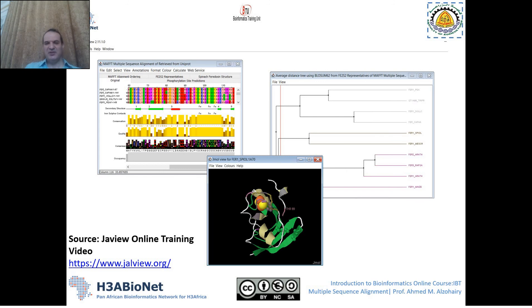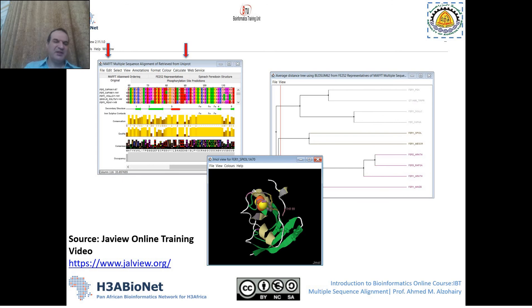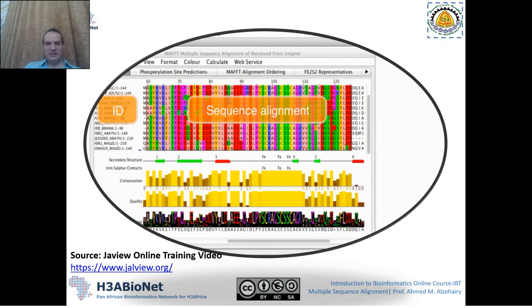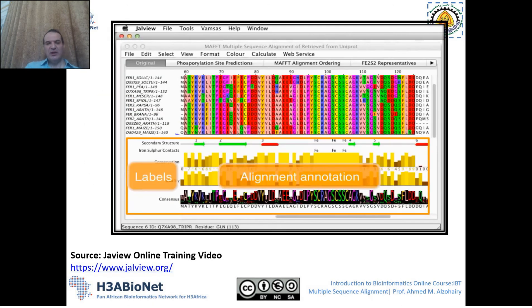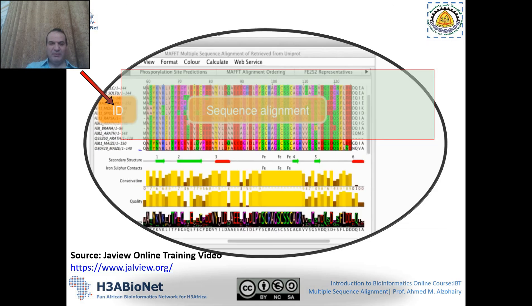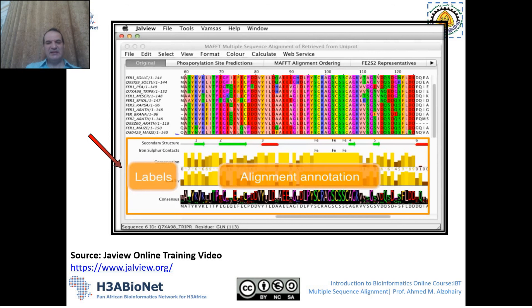One of the sequence alignment programs that can be used in Jalview is MAFFT, and you can retrieve sequences from many different databases like UniProt or others. This is the phylogenetic tree window and this is the 3D structure window. This session will only focus on multiple sequence alignment. In the alignment window, the upper part shows your sequence alignment and IDs, while the lower part shows sequence annotation and labels.